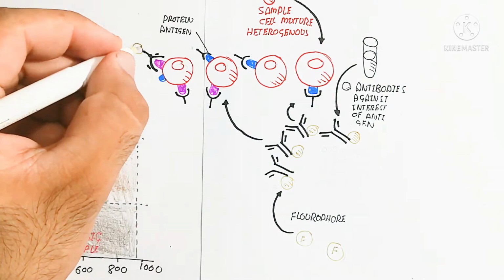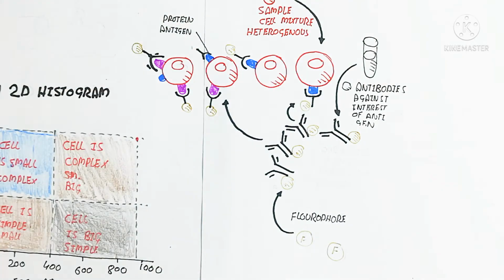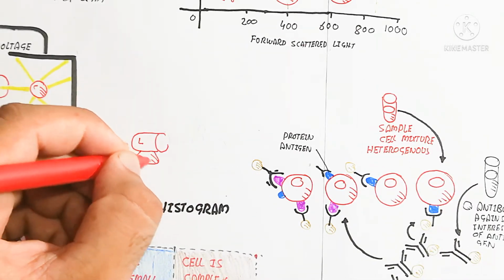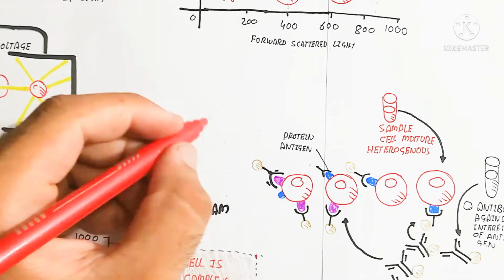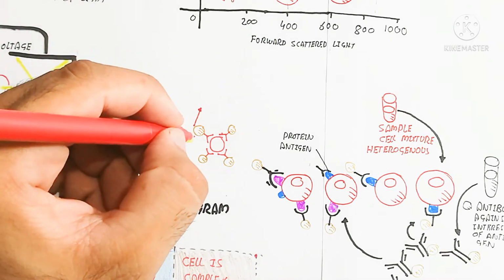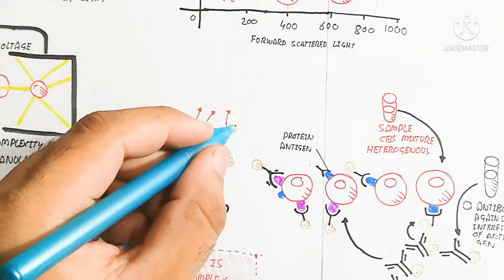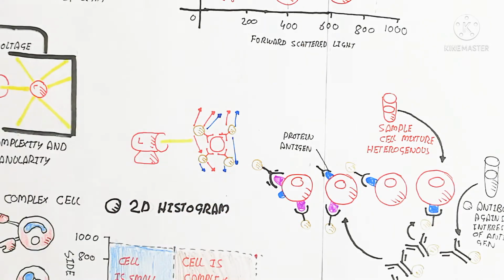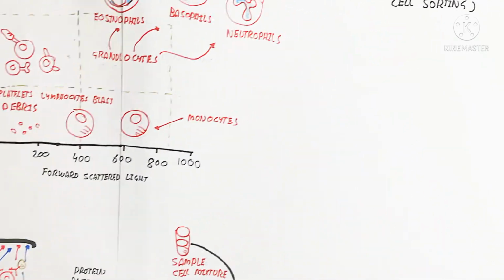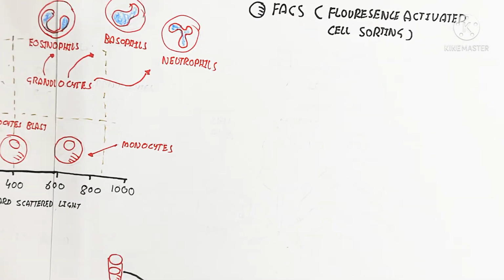So if these antibodies are against the antigen of that cell, it means we can bind this antigen with the antibody complex to show that structure. So these antibodies contain a fluorophore, so fluorescent luminescence. So this scatters more light, forward and side. That means we can detect this light from different directions. So we can use the cytometer to detect fluorescence to understand.